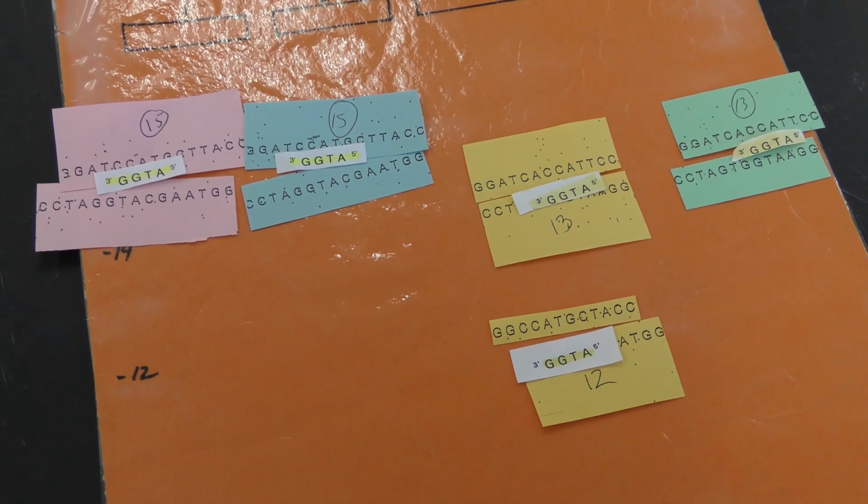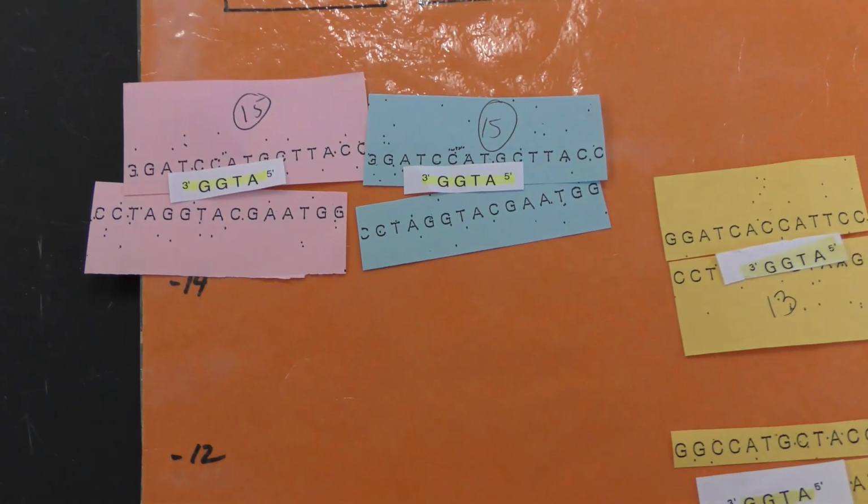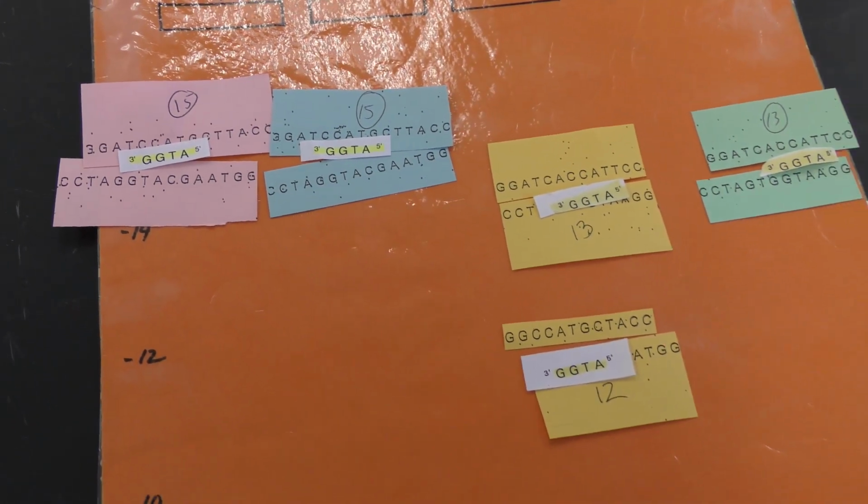And so basically what you can ask yourself through using a Southern blot procedure, can I differentiate between DNA 1 and 2? Can I differentiate between DNA 3 and 4 on the basis of the number of fragments that have been hybridized with the probe?